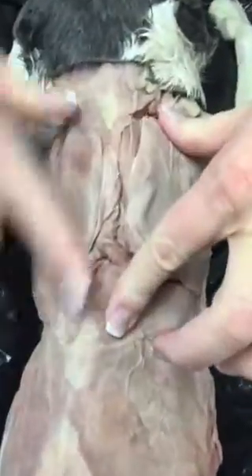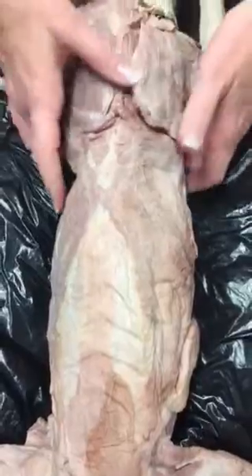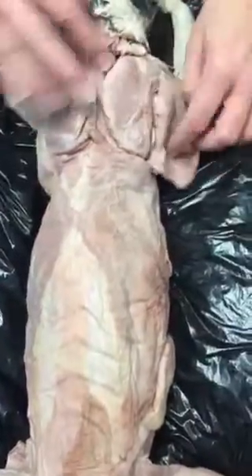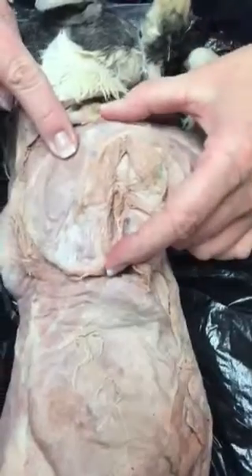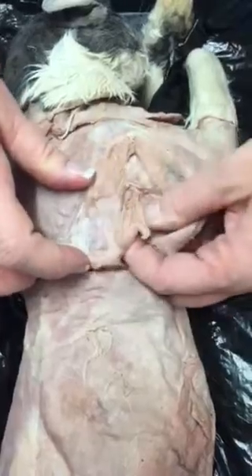Trapezius goes from the neck to this point. Then we have latissimus dorsi on the scapula. We have supraspinatus above the spine, infraspinatus which is below the spine, and then you have teres major. On the back side of the scapula, we have subscapularis and we have the rhomboideus.